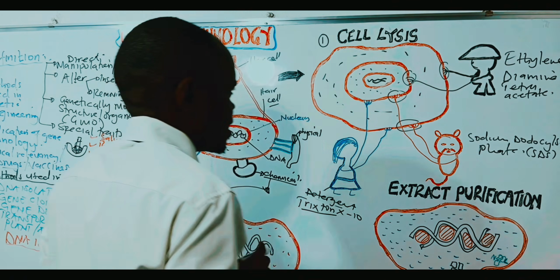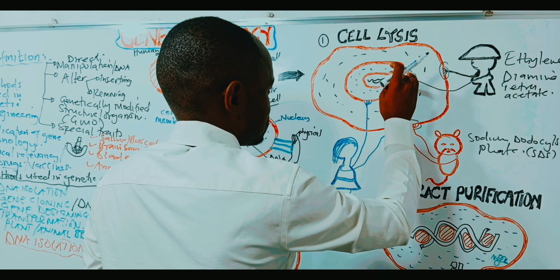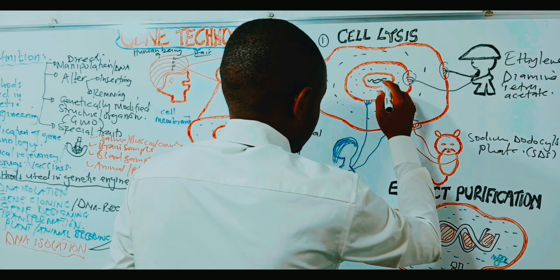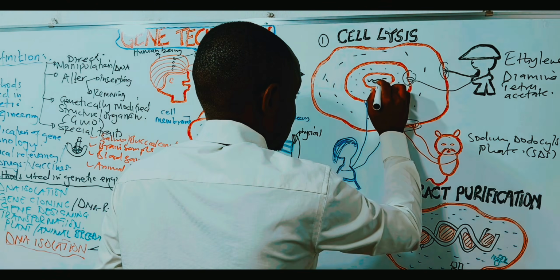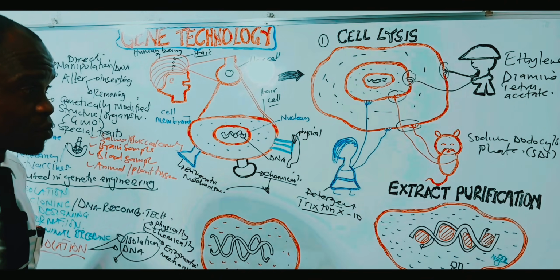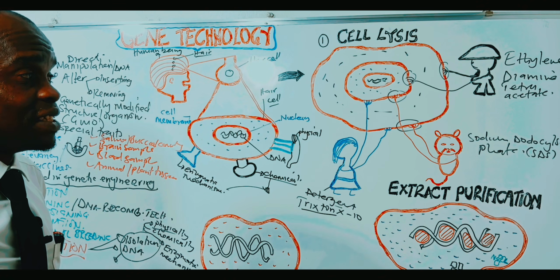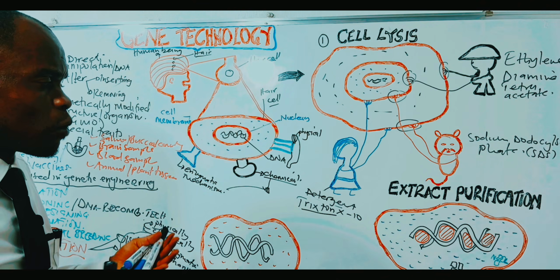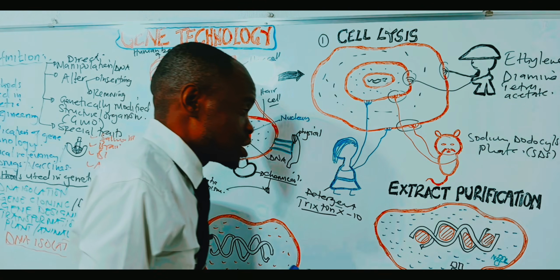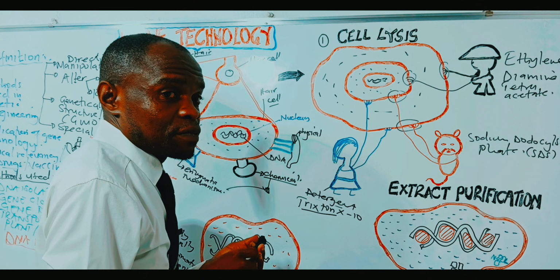There is something I've realized here. This is the DNA. Okay, let me take this to be the DNA. Now, I want to look at something very interesting here. We have finished the breakdown of these components inside the cell. What is going to happen here? That means we have a lot of impurities which are scattered within. The impurities are many there. If you look at the inside there, we have a lot of impurities. You get? Impurities are there.